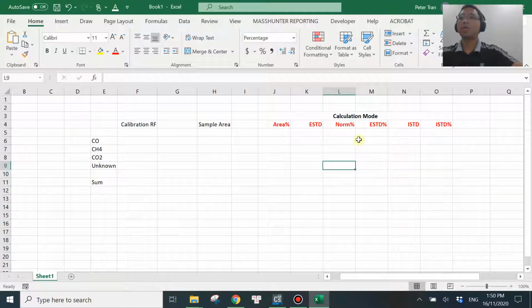In this video, I will be sharing the difference between the different calculation modes that ChemStation provides for you when it comes to calculation.